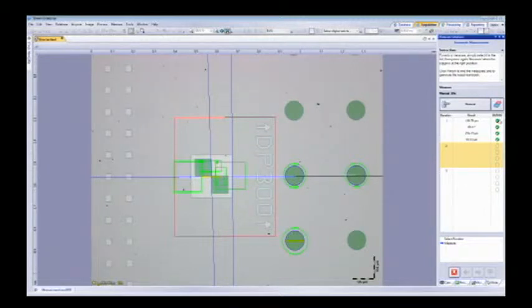So another thing real quick, we can see okay and not okay. So we programmed in tolerances. You can program in and do your inspection at the same time. So with these tolerances, it's a quick visual inspection that it's passed. If it didn't pass, maybe they need to take the sample off and do more processing to it.